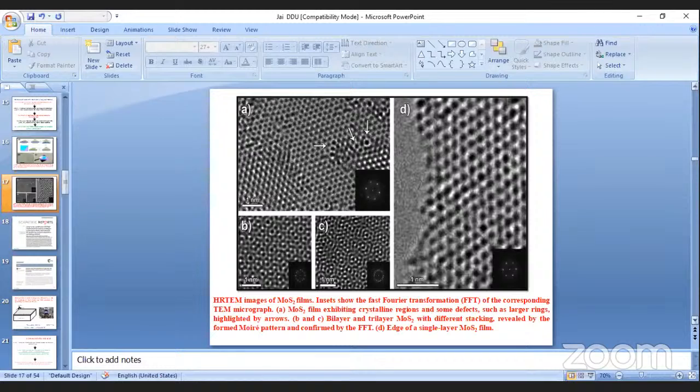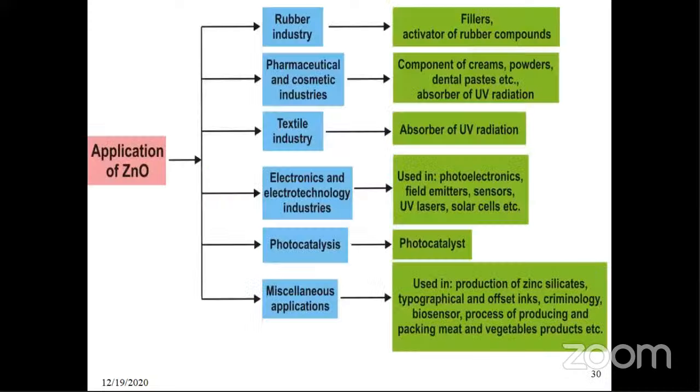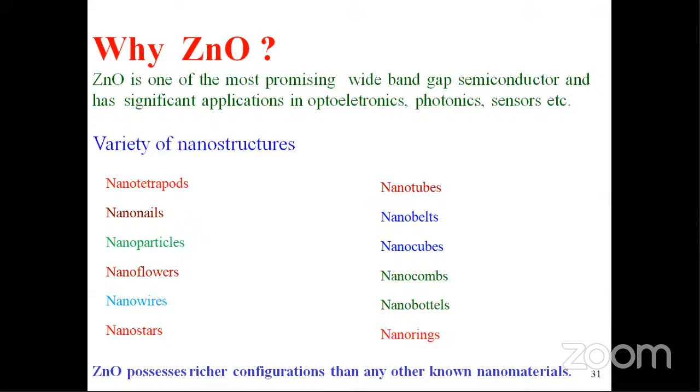Okay, thank you. Zinc oxide is very important nowadays for different industries. Using different factors, it is wonderful, and by a simple method, a flow of oxygen, a flow of argon, and zinc powder, that is one of the very simple ways, and with the help of this we can see here.